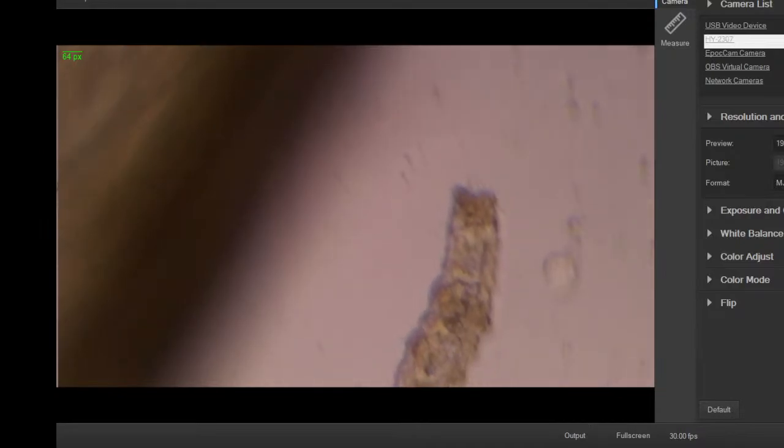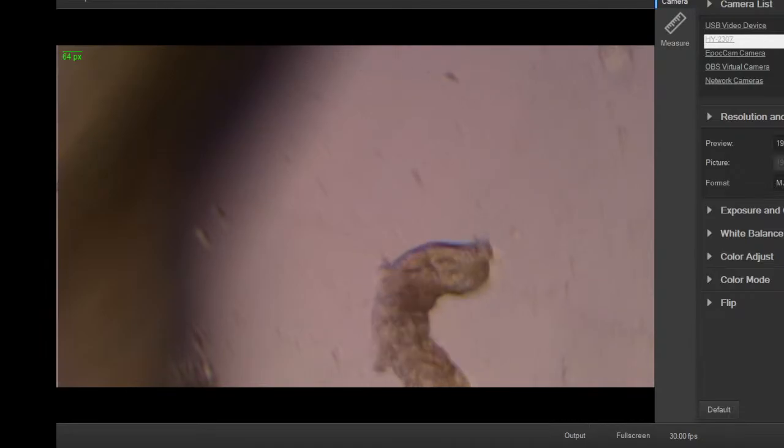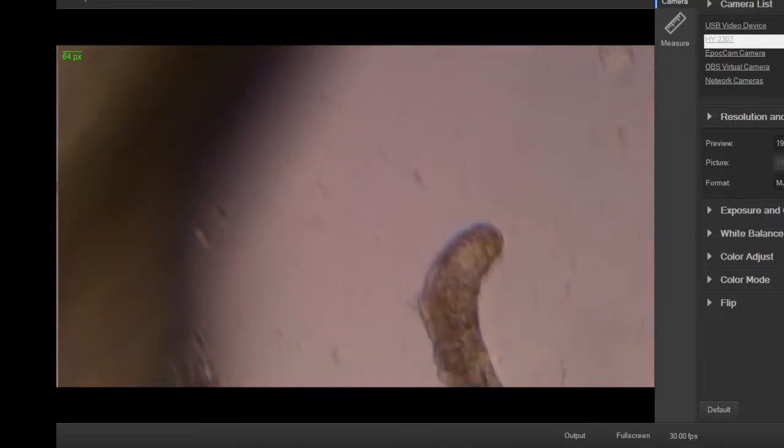They're about half a millimeter in size. So, quite small, but big for a microscopic item. You can have a paramecium swimming right by them. In fact, look at some of the ciliates that are in here now, the small ciliates. They're not too small compared to this guy. And they're all unicellular, he's multicellular.